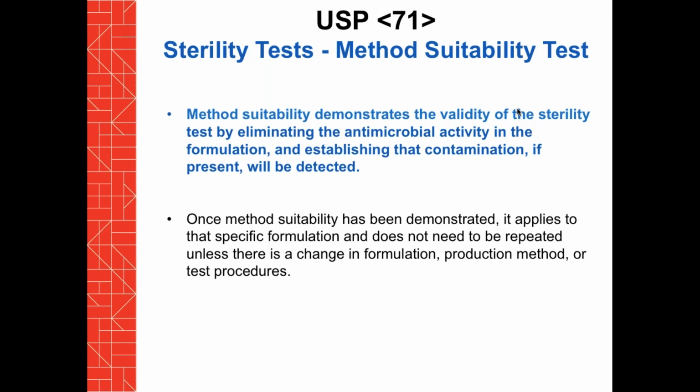The method suitability demonstrates the validity of the sterility test by eliminating that antimicrobial activity in the formulation and establishing that the contamination, if present, would be detected. So you're trying to minimize or eliminate the antimicrobial activity. Should a bacterium or spore be present, it could be detected.